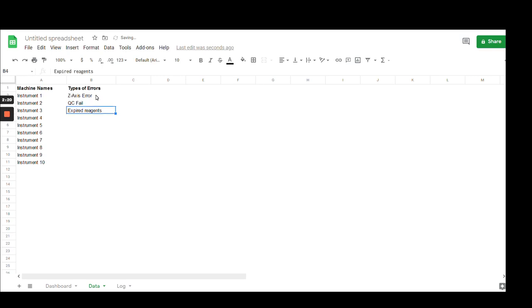So this could be like a machine that's not used very often, we're putting too many reagents on, or if you want to track samples, maybe a meth lot, or someone has an issue with collection, say hemolyzed QNS, and you can track where they came from, or really whatever you want.